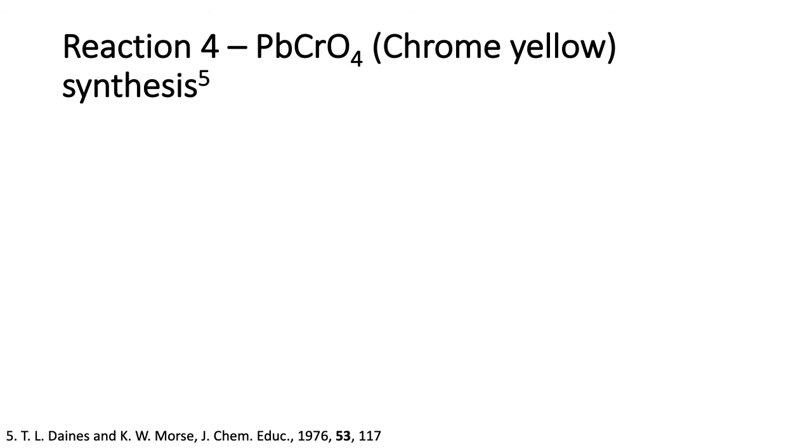Waste. Now, chrome yellow synthesis. I think this would be a good day-long first-year reaction.